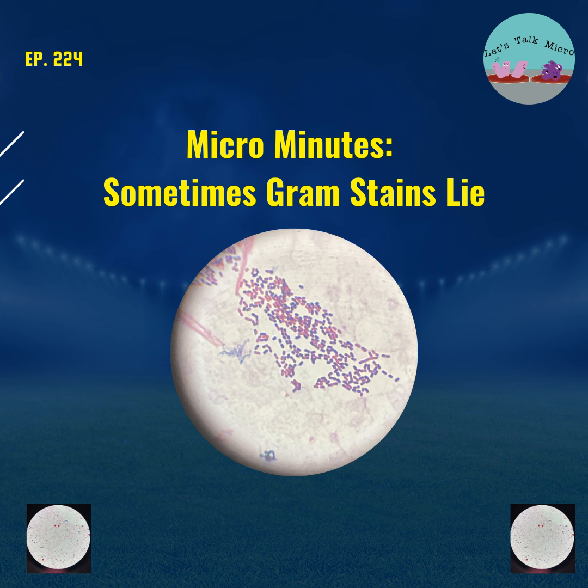Now, even let's say you have done your procedure the correct way. You're looking at your slide and there have not been any mistakes. It is a gram negative, and now the issue is you cannot tell: is it a cocci? Is it a rod? Well, when you have that scenario, you probably have Pasteurella or Haemophilus. Those are coccobacilli. They're very tiny, some of the species, and sometimes you have a hard time telling if they're cocci or rods. And some things that can help you with this is the size.